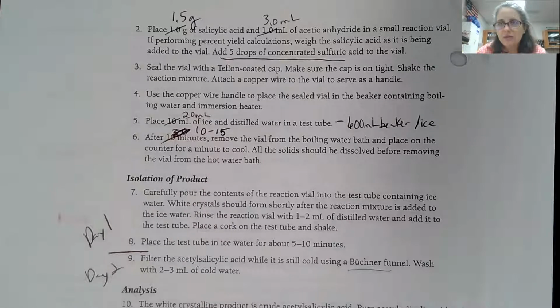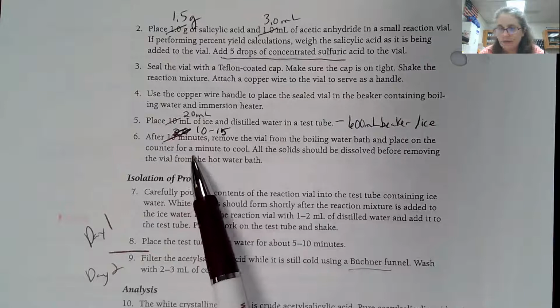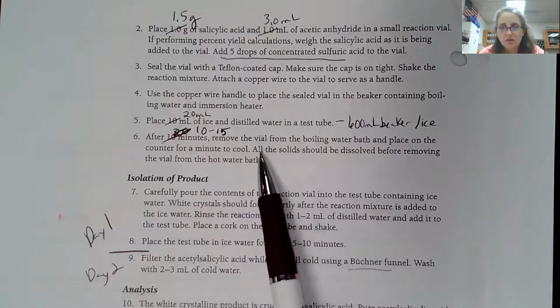So in the procedure, it says about 10 minutes, but if I give you a window of like 10 to 15, we will definitely cook it for at least 10. We need to cook it for at least 10. Once you have cooked it for that period of time, you're going to place it on the counter for about a minute to cool so that you could touch it.